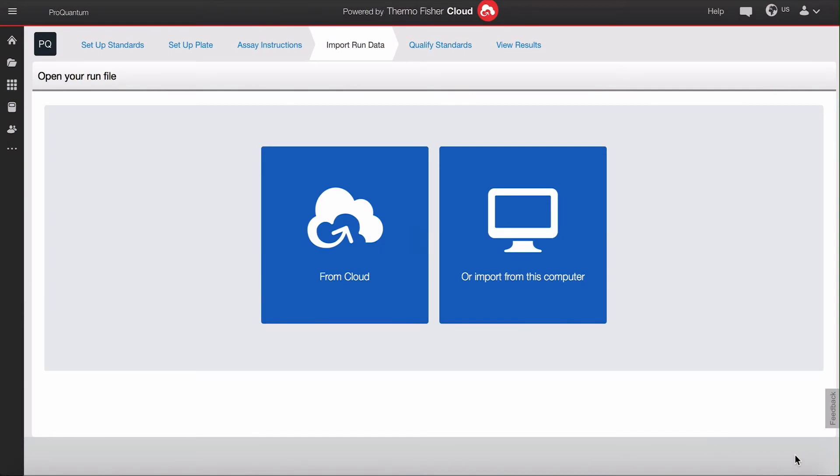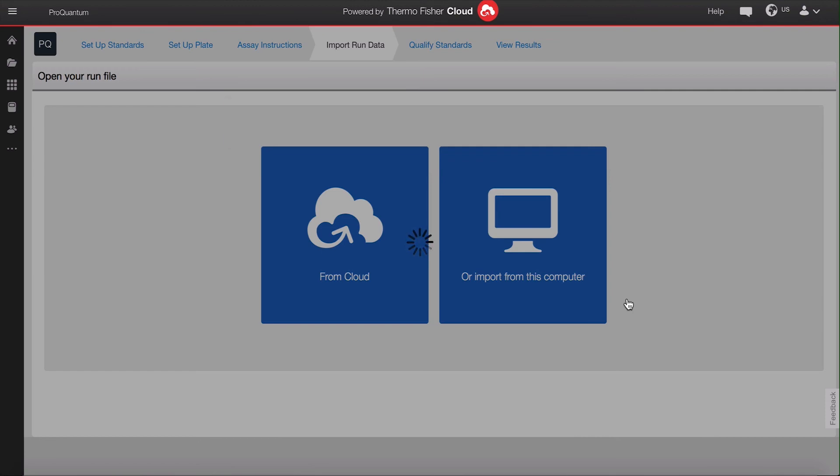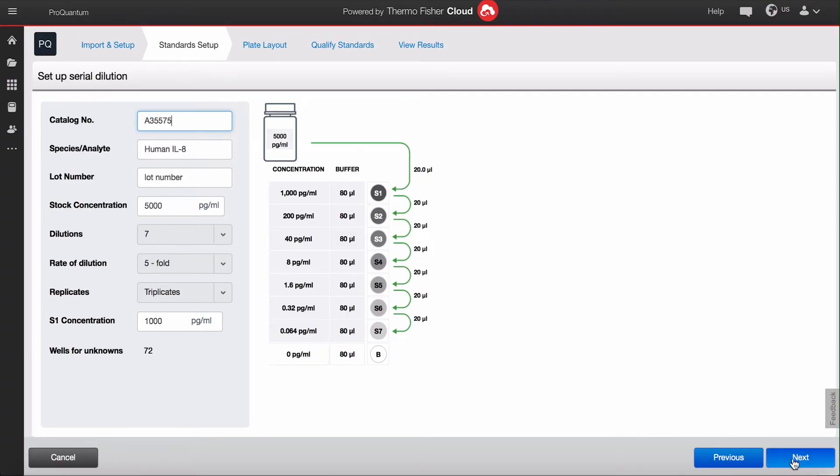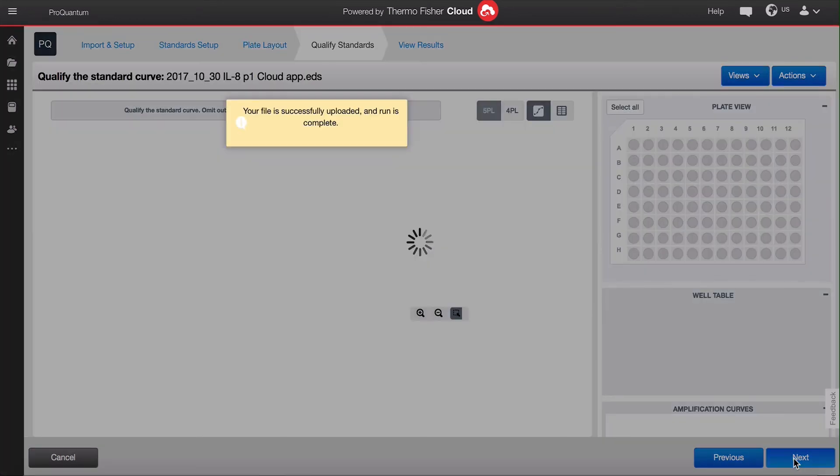When you return to the ProQuantum software, click on import the file from this computer. Apply the plate design that you previously saved. Verify that your standard curve and plate layout design did not change during the actual run at the lab bench. Now the software is applying the data to the specific plate layout and generating the curve fit.